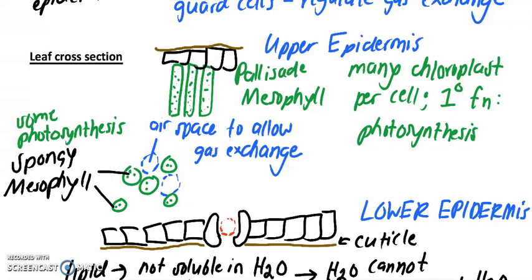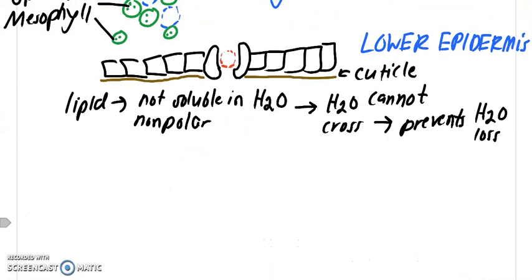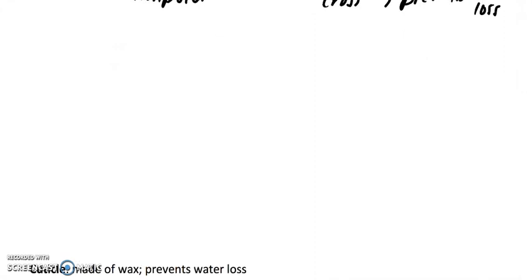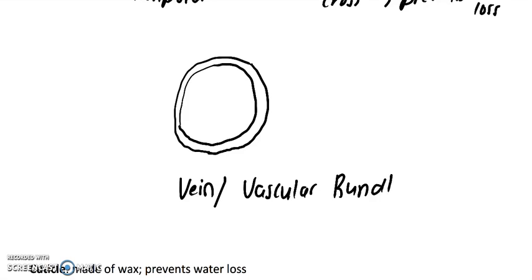The upper epidermis. Okay. So last set of structures inside the plant, inside the leaf, you will have something called a vein. You know, veins in the human body can transport things. It has a similar function in the leaf. So here would be a vein in a leaf, or it can also be called a vascular bundle.